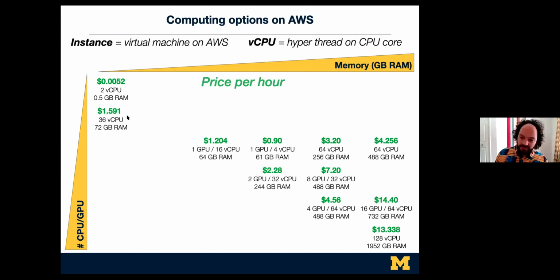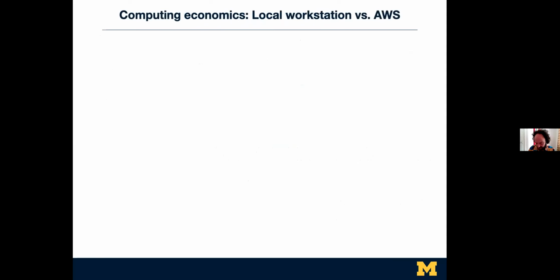And so that's part of this, that there is a cost to doing this. The upfront cost is low, but over time, obviously they're a business, they're going to make money on the fact that if you just keep using this, there is some sort of markup for them by giving this to you on demand. So to give you a sense of this, I thought I would do a calculation.